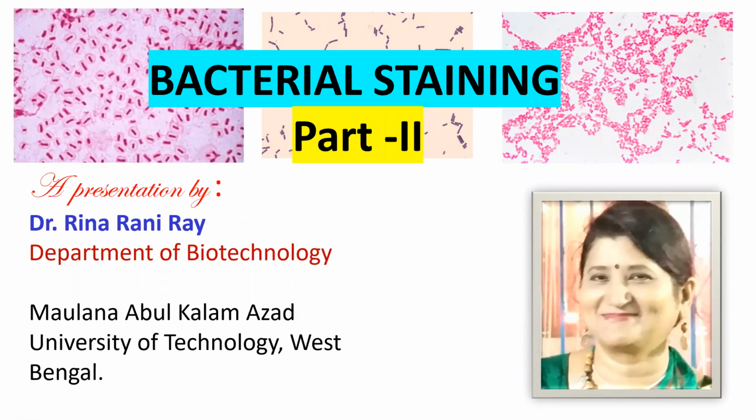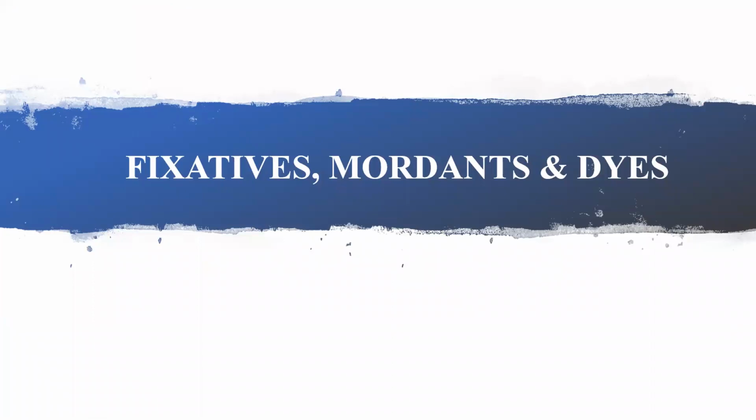Welcome to the second part of our bacterial staining discussion. Before starting, let us discuss fixatives, mordants, and dyes. So what is fixation and fixative?